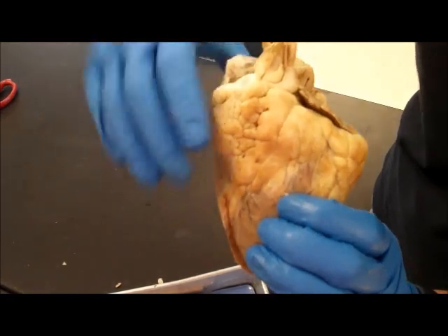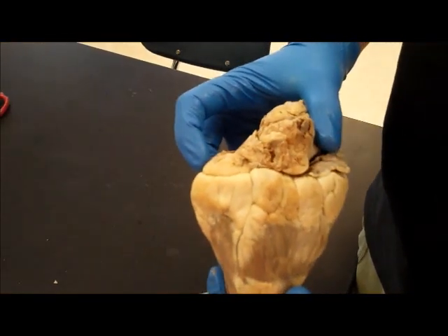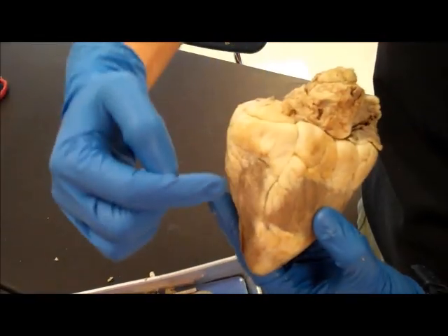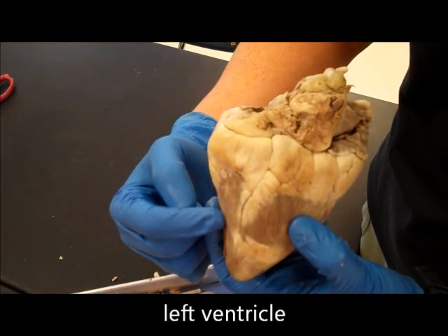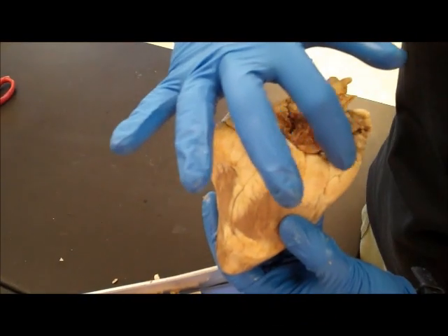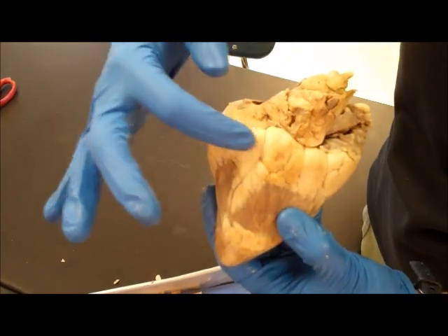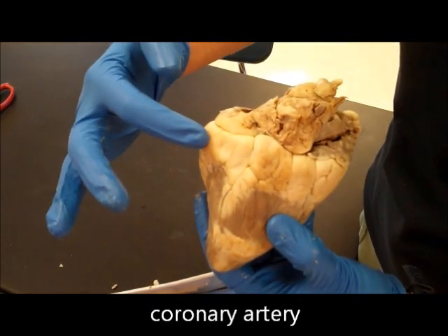Now we're going to take a view of the back side or dorsal side of the heart. And again, you've got your ventricles, you have your left ventricle, you have your right ventricle, you've got a lot of fat back here, and underneath this fat you have coronary artery on the back of the heart as well.